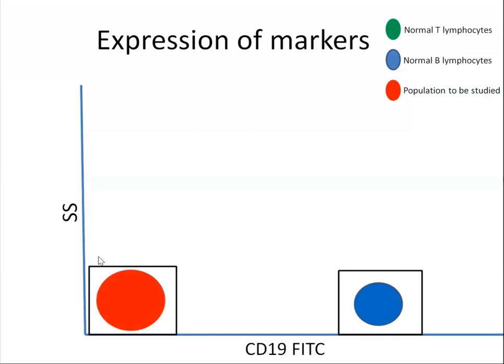Now, if your blast is falling right on this region of negative internal control, then it is negative, no doubt.